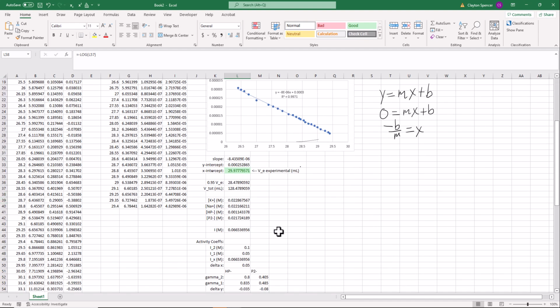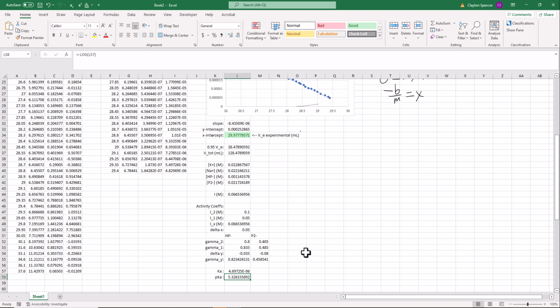I will save this spreadsheet as well so that you can go back and look at it if you need to check out any of my formulas or remember anything that I've done. So I know these calculations are a bear, but bear with it and you'll be fine.